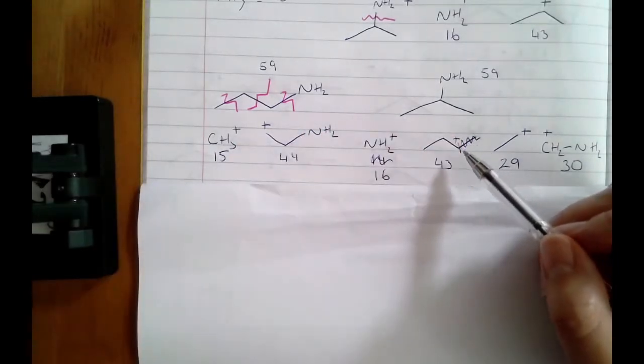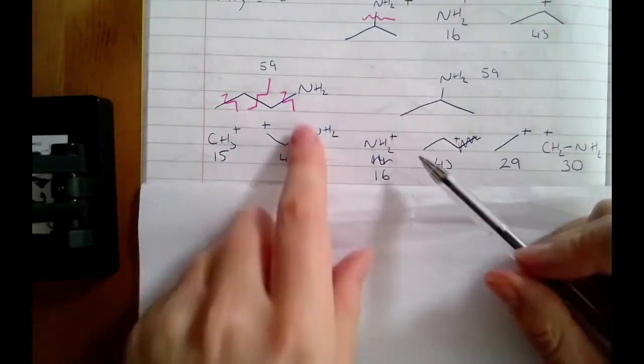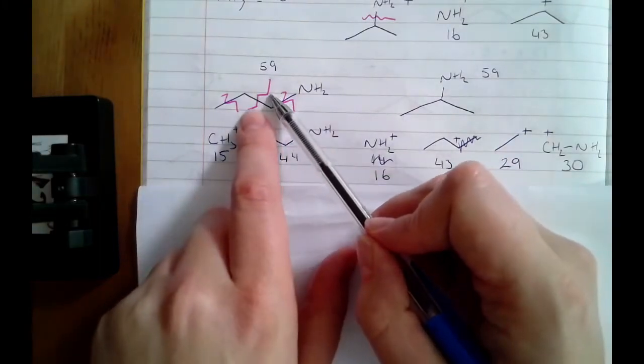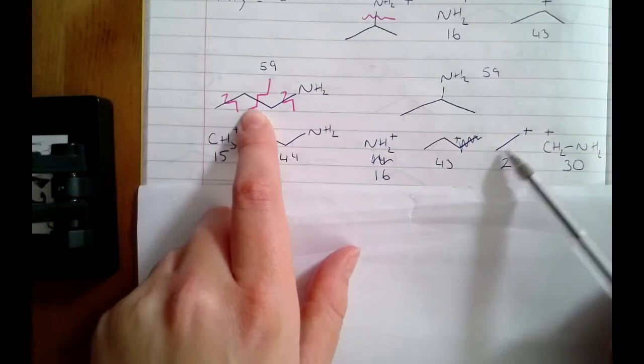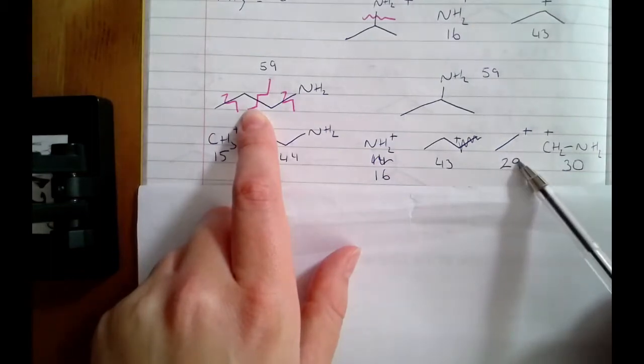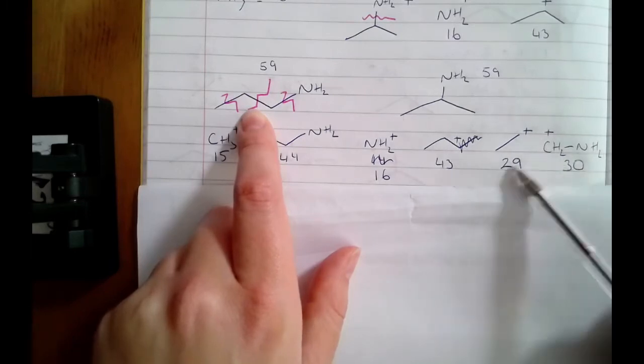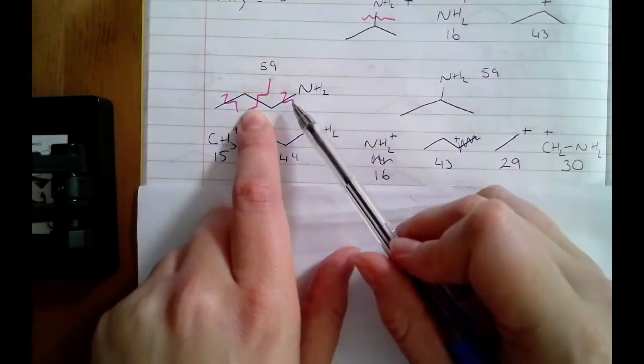However, you are also asked for a peak that is unique to 1-aminopropane. If I break this middle bond here, I end up with a C2H5, which has a mass of 29, and I end up with a CH2NH2 with a mass of 30. These 2 peaks are unique to 1-aminopropane.